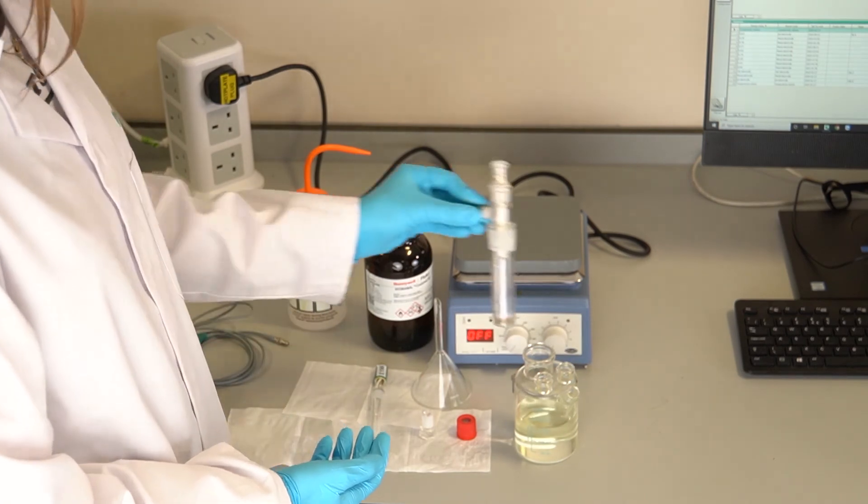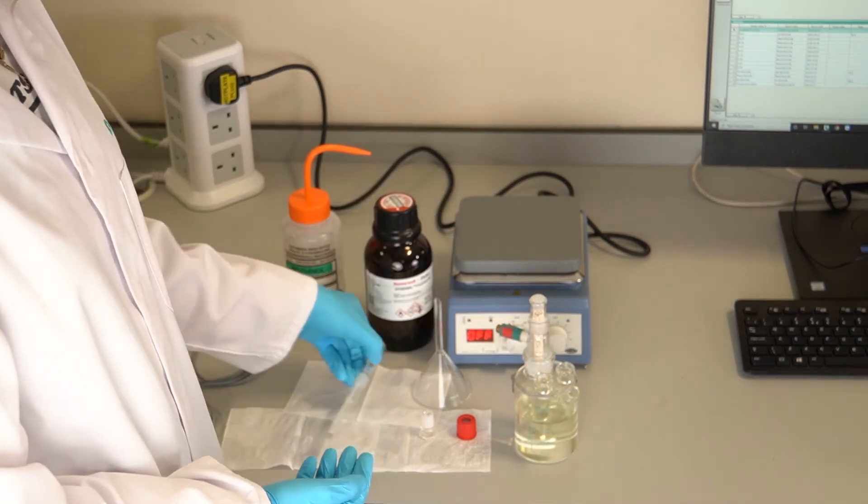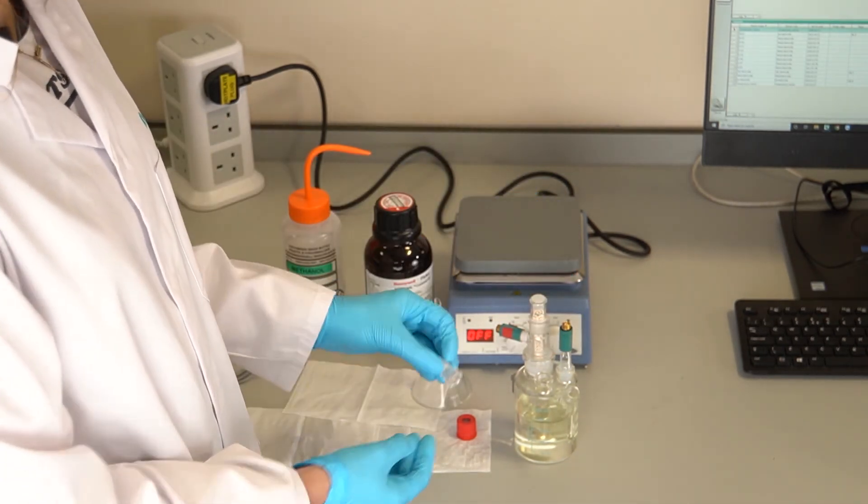Reassemble the cell ensuring all cable connections are made correctly. The cable terminating in the larger connection should be connected to the generator electrode.